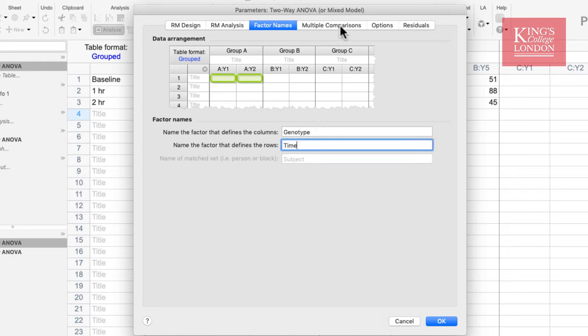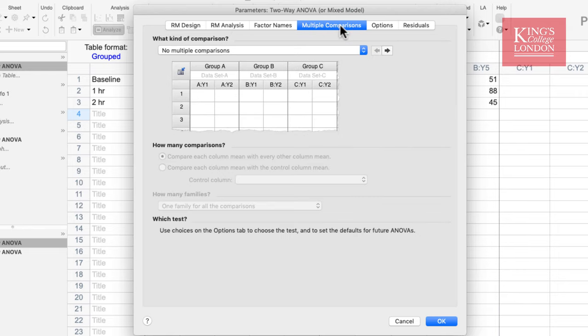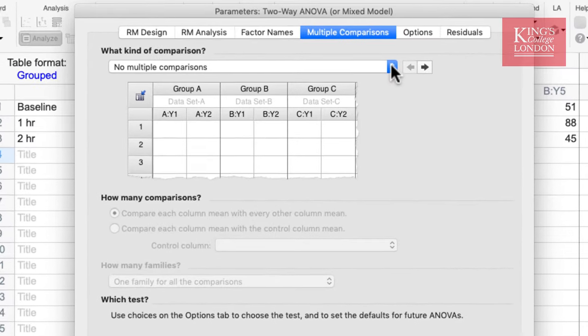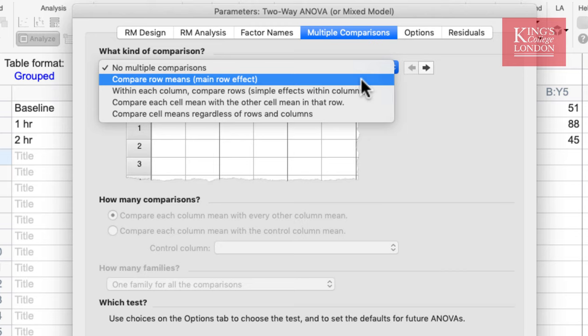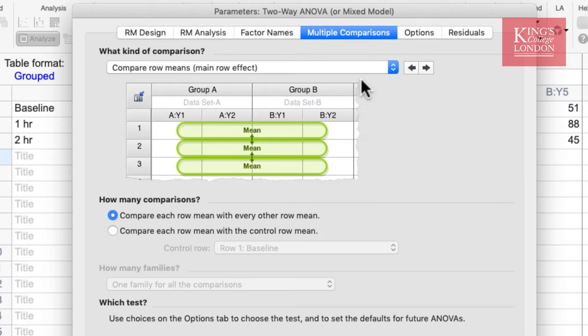We then go to Multiple Comparisons, and this is where the post-hoc tests are defined. By default, there are no multiple comparisons set up. Using the drop-down box, you can select which multiple comparison tests to undertake. Prism will give you a handy hint in the graphical presentation underneath the selection box, so when you choose an option Prism will show you what it is comparing. In this first case, it is only comparing the rows and does not take into account the different columns.